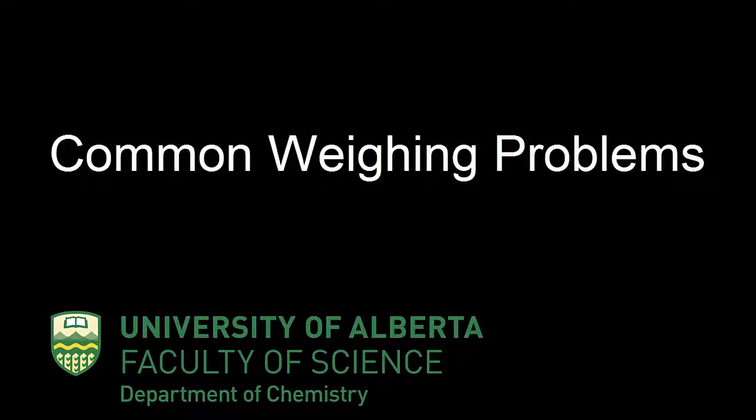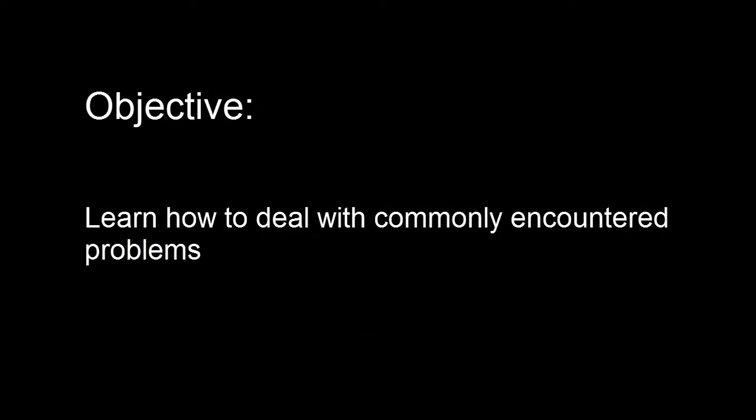Common Weighing Problems. The objective of this video is to learn how to deal with commonly encountered problems. Commonly encountered problems with electronic balances nearly all relate to the difficulties encountered in obtaining a stable reading. There are a variety of reasons for these difficulties.